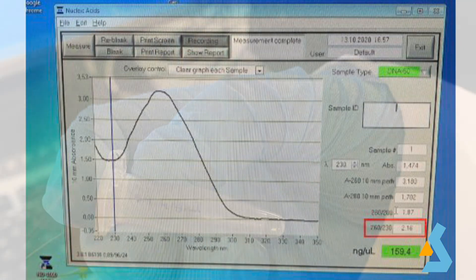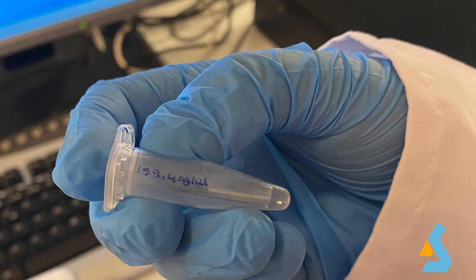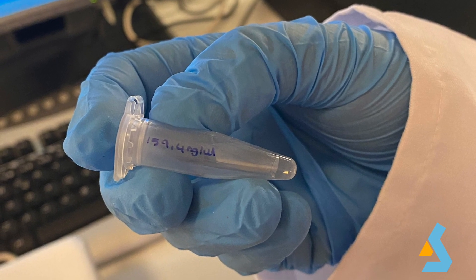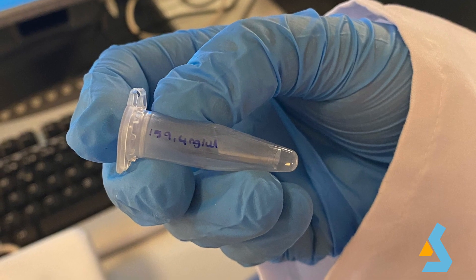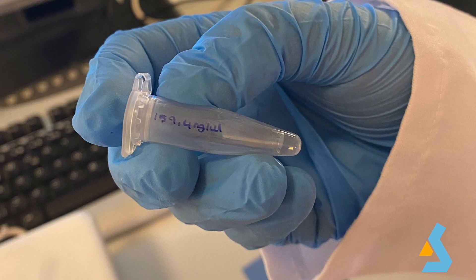If the values are correct, what we need to do is to write down the concentration of plasmid DNA on the tube to avoid any confusions in future studies. The plasmid that is purified can be stored at 4 degrees Celsius or minus 20 degrees Celsius.